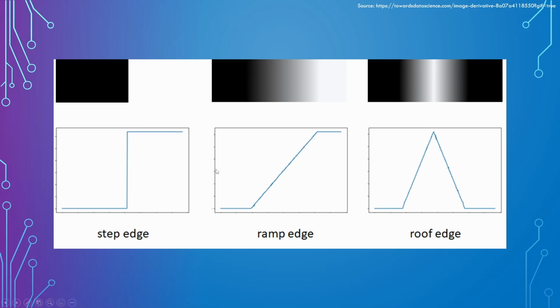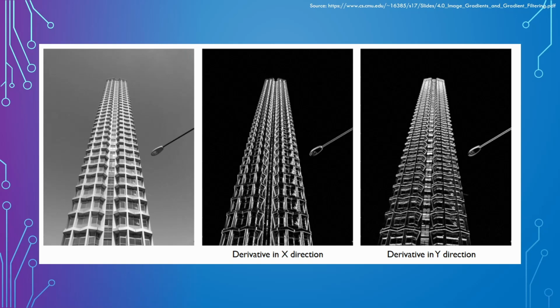So we can actually create a sharpness map if you want. And here I have the example of an apartment building on the left-hand side. And here we just take the difference between every adjacent pixel in the x direction and in the y direction. And you can see the sky is very uniform. And in the derivative, or the difference of the pixels for each image, it's pretty much black. It doesn't change at all. But when you actually go to the edges and the detail of the building, you can notice that those are the most salient, or most present, parts of the image derivatives.